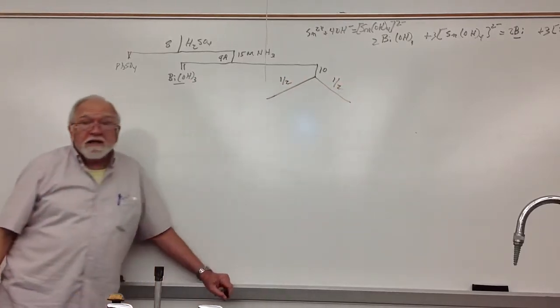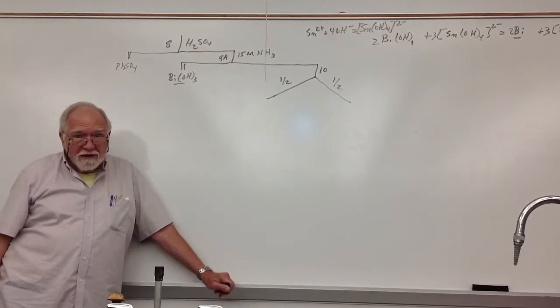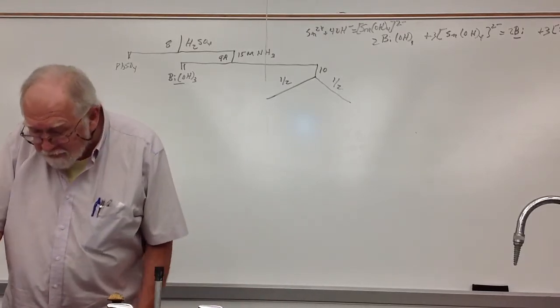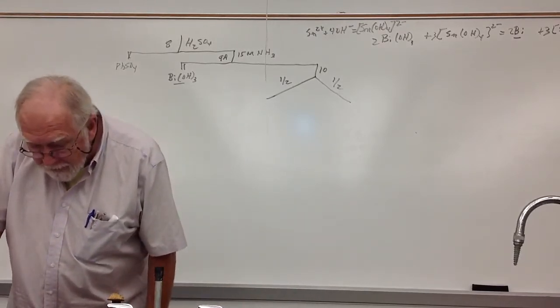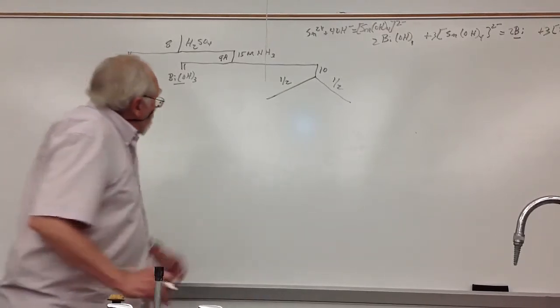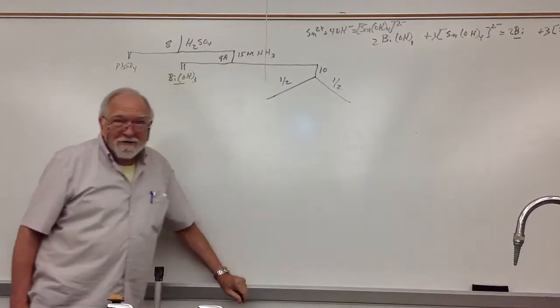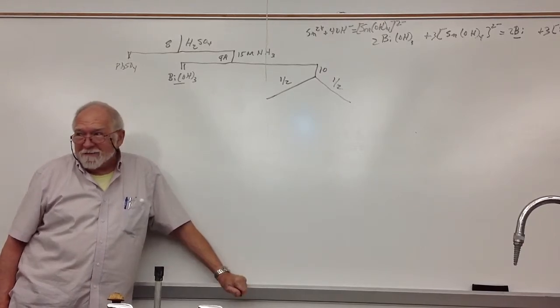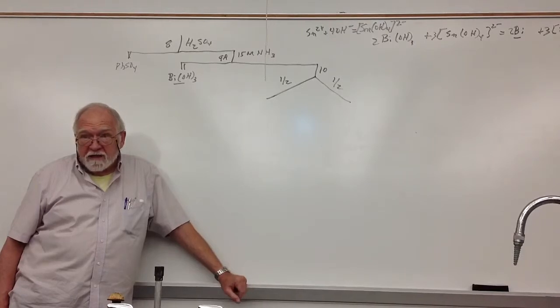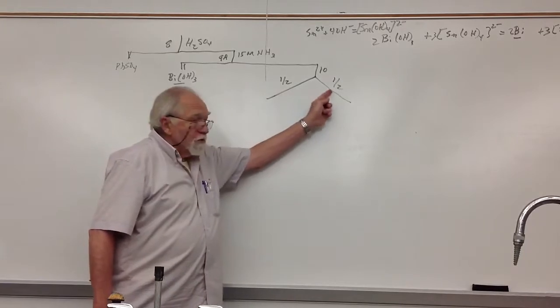Divide the solution into half. He says take 10 drops, okay? Because he's assuming you got to that point with 20 drops. So he says 5 drops. He assumed you got there with 10 drops. But remember, way back here I said you can't add too much ammonia. Some people add 15, 20, 30 drops of ammonia because they want to be sure. So the simplest thing, so things will always be consistent, rather than taking 5 drops like he says, you just divide this solution into half.